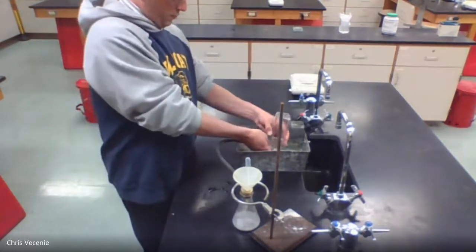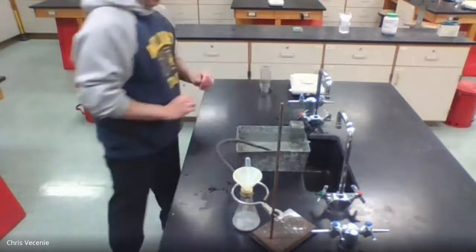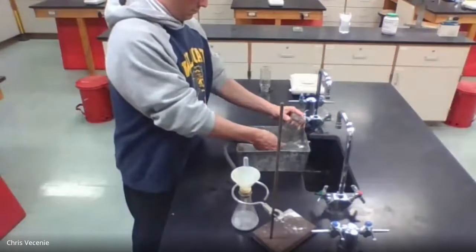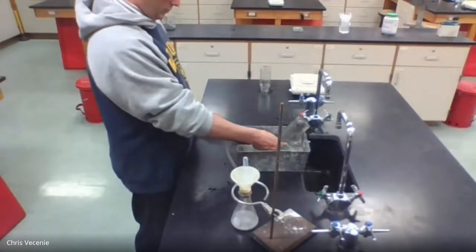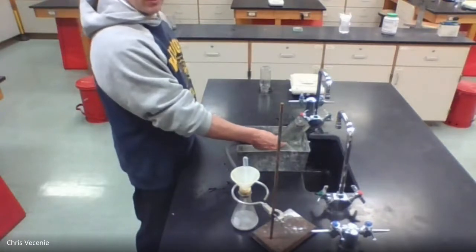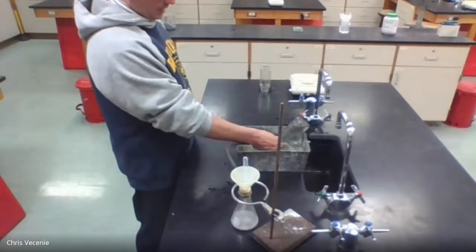Okay, sure enough, looks like we're full. So we'll lift that guy out, move him over here. All right, so we've got one good hydrogen bottle, and now we're on to round two. But a little science going on here, right? Notice these bubbles are going up through the water. So we have confirmed the low density of the hydrogen gas.